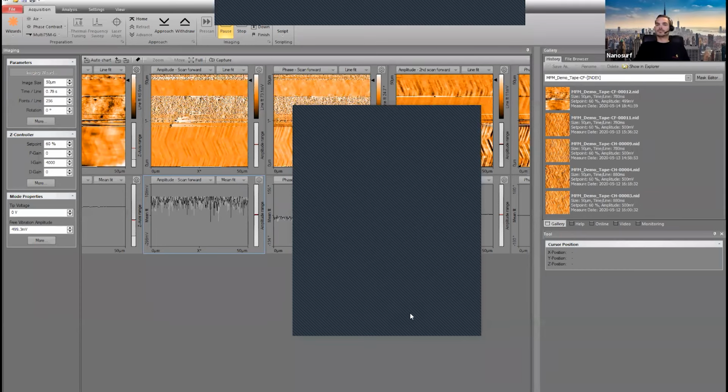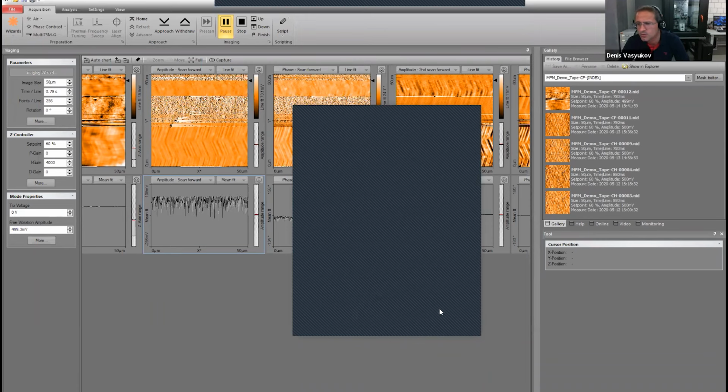Is it necessary to magnetize the tip and the sample, or only one? Well, obviously, once you get your tips from the supplier, they have only spontaneous magnetization, whatever it is. All nanostructured magnetic things are magnetized one way or another. So you have to ensure that your tip is magnetized the right way and fully magnetized, not just halfway. The way we do it, we have a bunch of permanent neodymium magnets, very little ones, or I can get a bigger one. It doesn't really matter because the tip is so small.